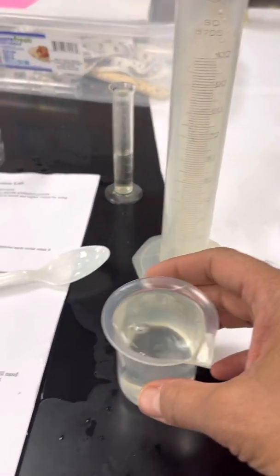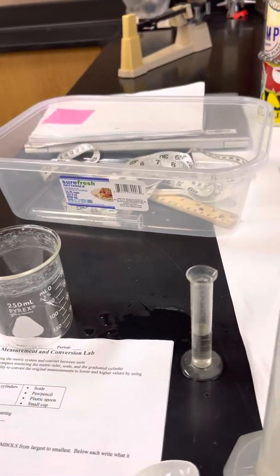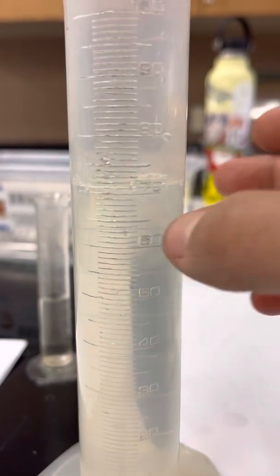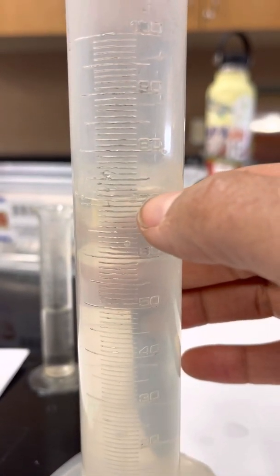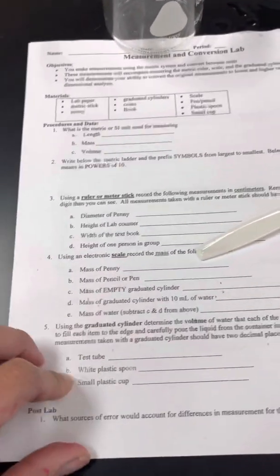Okay, let's see how much it fills. It does say 50, but I went over that, so let's pour it in here. It's probably going to be 60-ish. Okay, so it is 50, 60, 70, about 71.0. Okay, so that's all the data you need for all these sections.